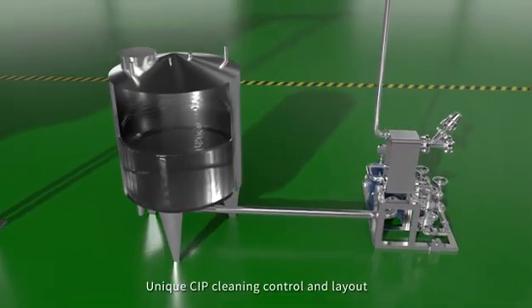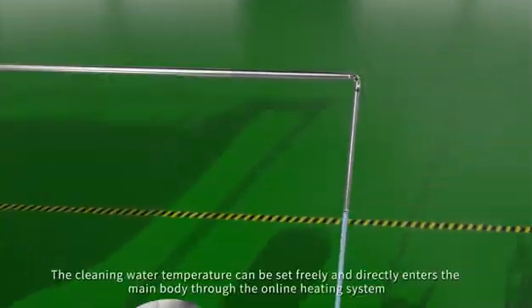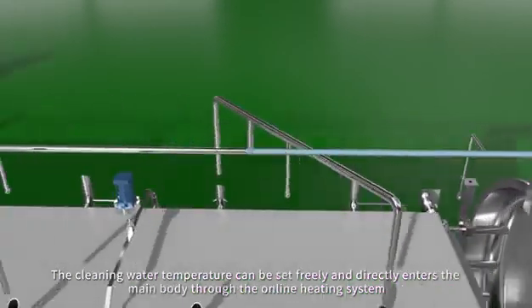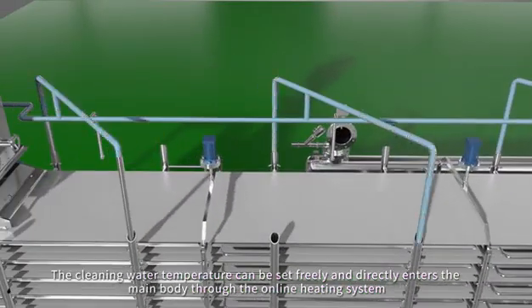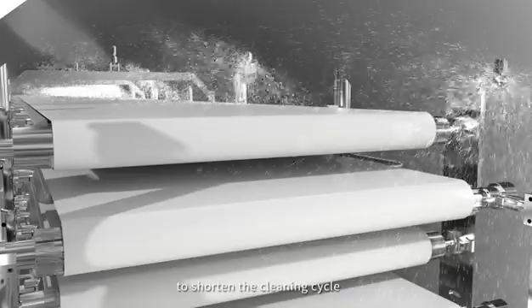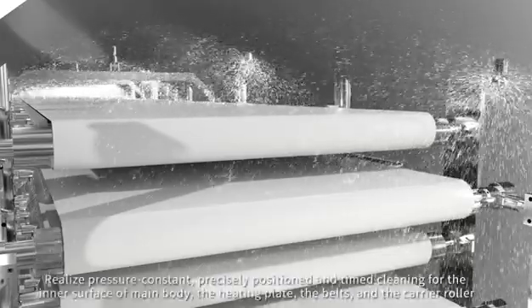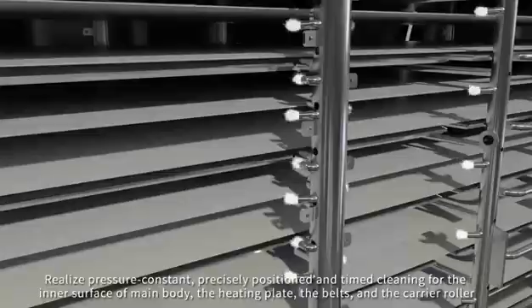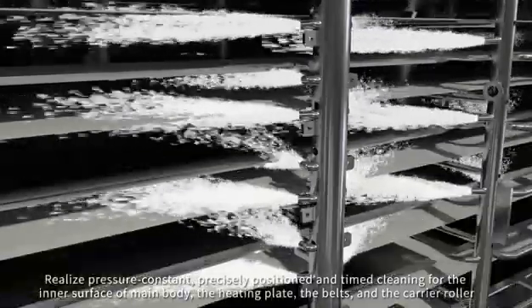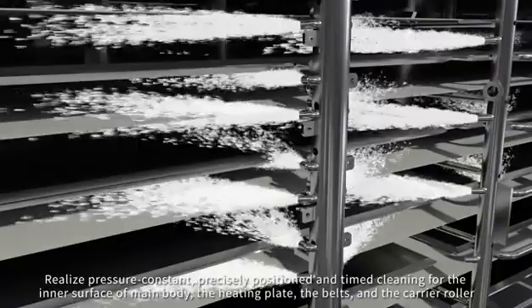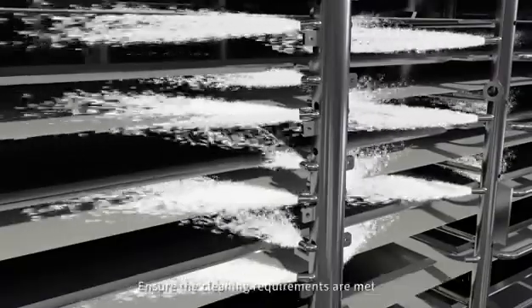Unique CIP cleaning control and layout. The cleaning water temperature can be set freely and directly enters the main body through the online heating system. To shorten the cleaning cycle, realize pressure constancy, precisely positioned and timed cleaning for the inner surface of main body. The heating plate, the belt, and the carrier roller ensure the cleaning requirements are met.